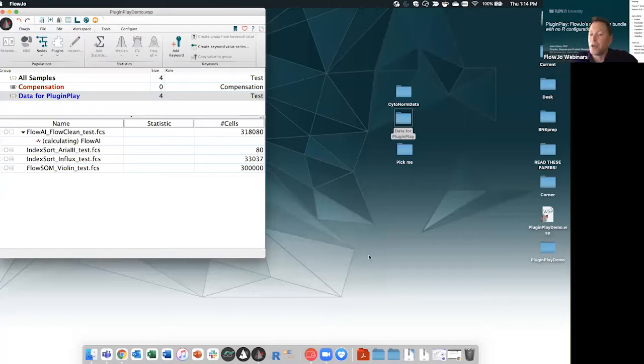And then I can move on using the good events gate. Let's see. From Shannon, is a follow-up: are you running FlowAI on the raw files from the Aurora? And if so, how do you apply that to the unmixed files?